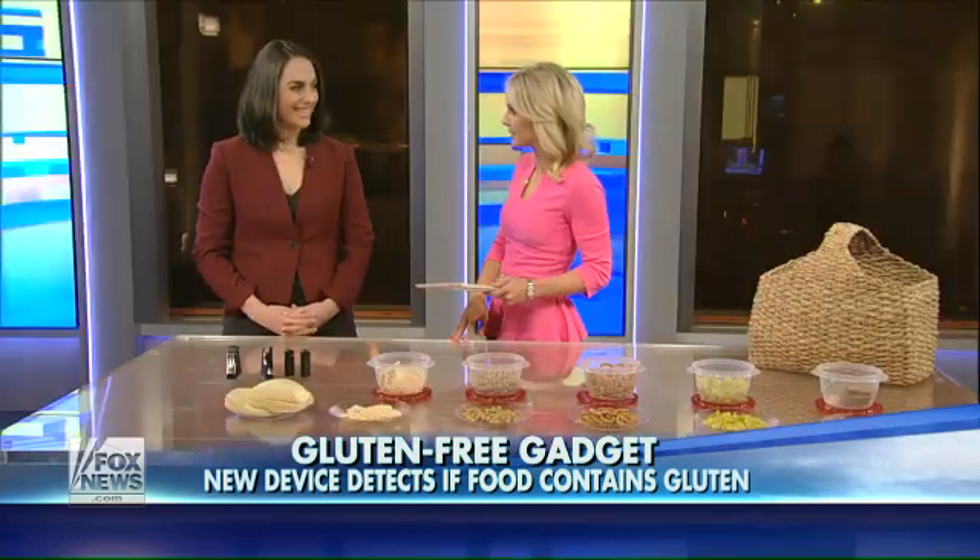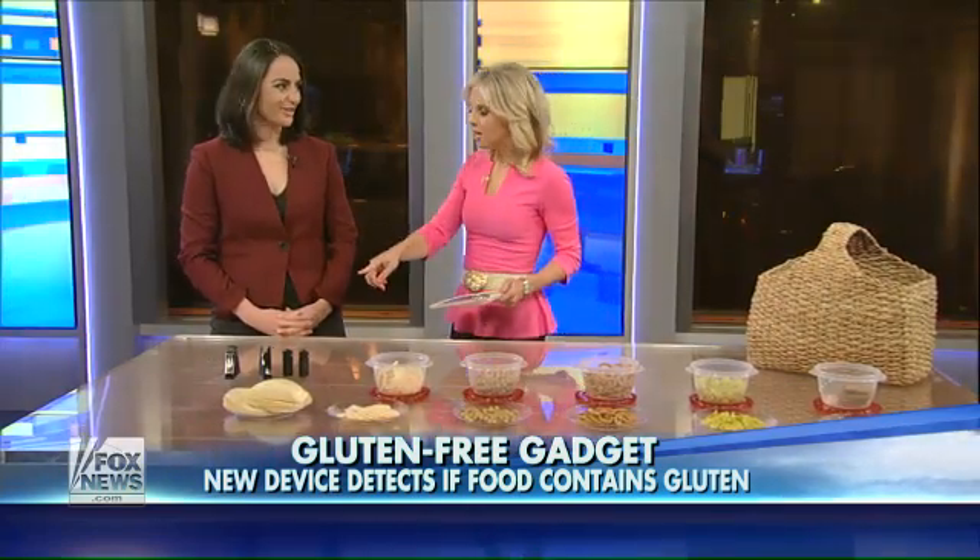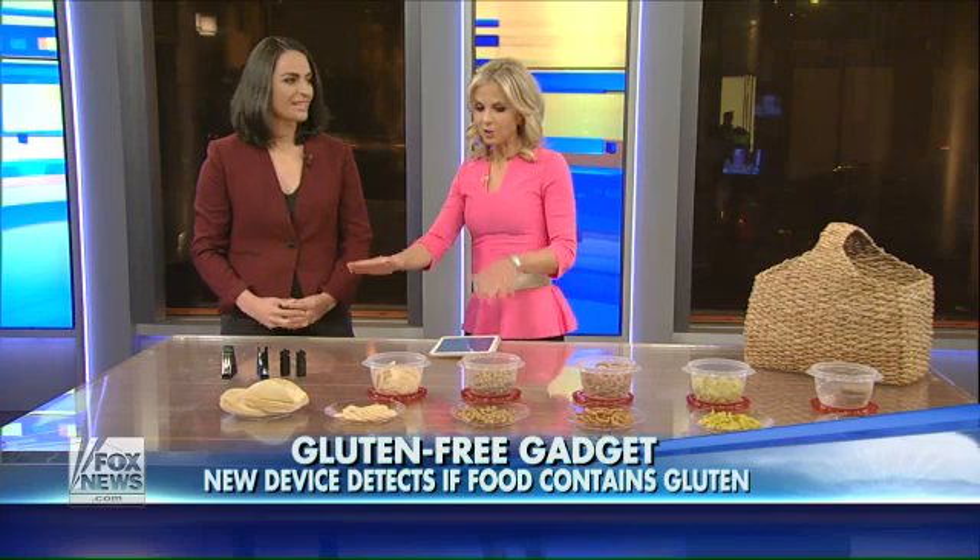My next guest came up with a surefire way to test the safety of any food anywhere. Shireen Yates is the CEO of Sixth Sensor Lab. She joins me now with a product called NEMA. Great to be here. Am I saying that properly? You are, yes, absolutely. So right now, you're going to start this test for us and then explain how it works.